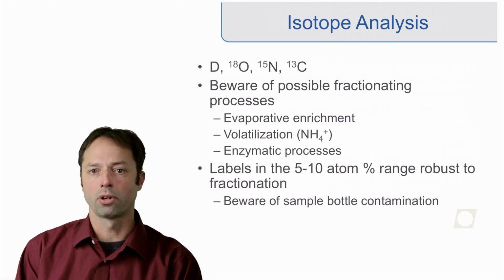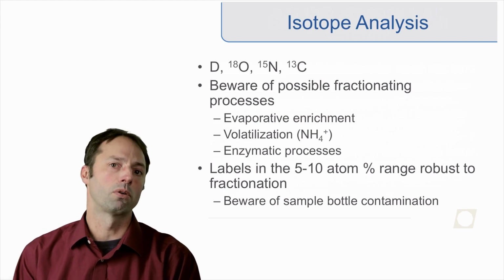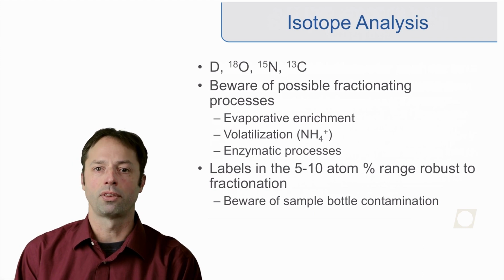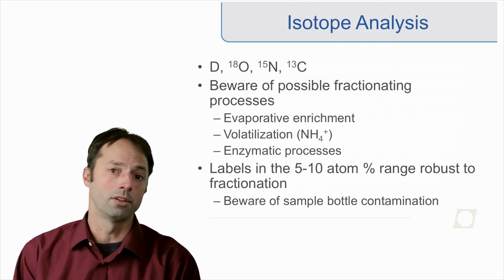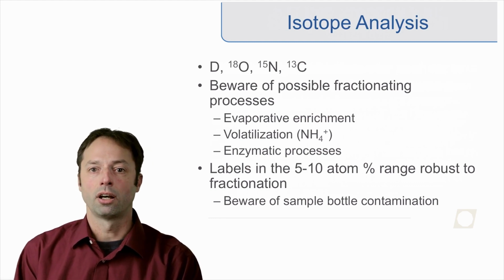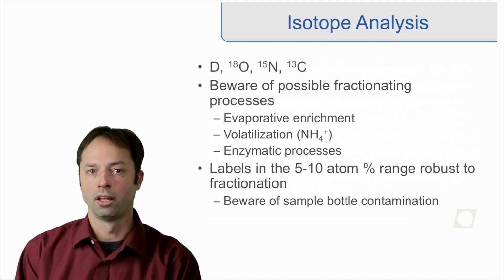So you probably don't need to worry about it. However, if you have a continuous method that's occasionally having to pull more vacuum, you may be losing some of your water vapor that is a different isotope ratio than that in your actual sample, and that can result in fractionation that isn't the same as what you pulled out of the soil in the beginning.